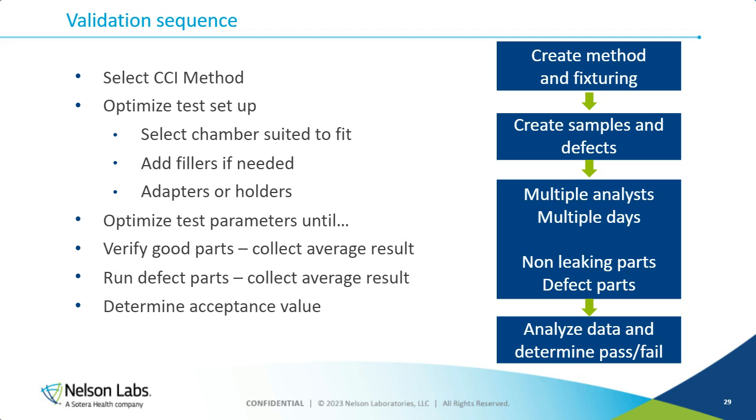If you were using one of those detector emitter methods, you might need some adapters or holders to place the sample in exactly the right position so that you could run those tests. But let's assume that we've got all that test setup taken care of. We figured out our method, and we've got our parameters all wonderful. We've passed all those hurdles, and we're ready to go.